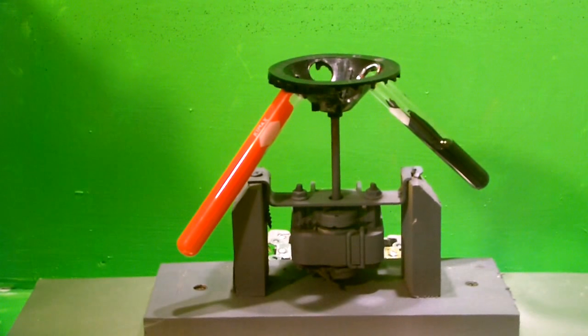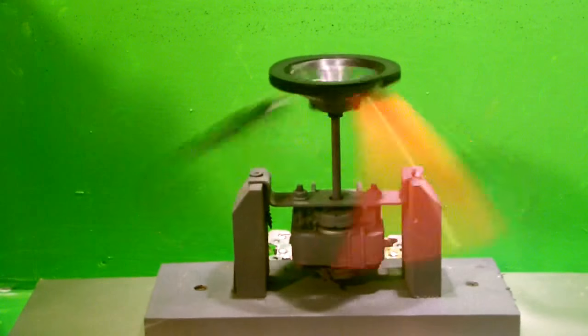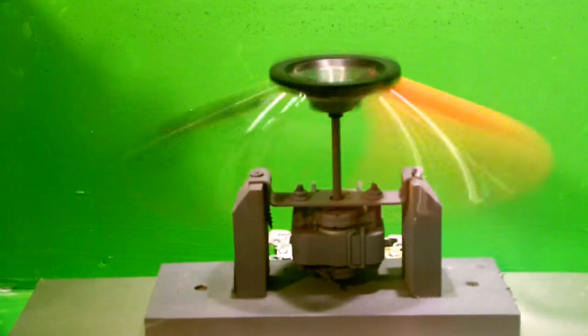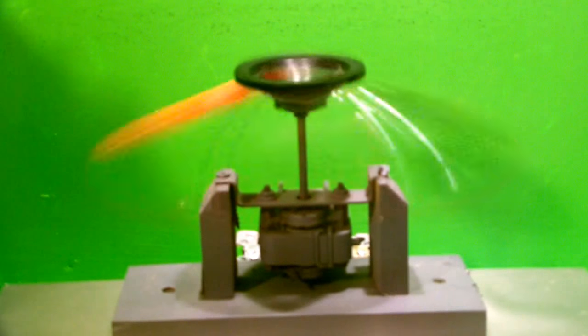So I'll show you as I switch it on. Keep in mind that the paint is a little heavy so it's heavier than normal stuff that you'll be centrifuging but it's pretty smooth.